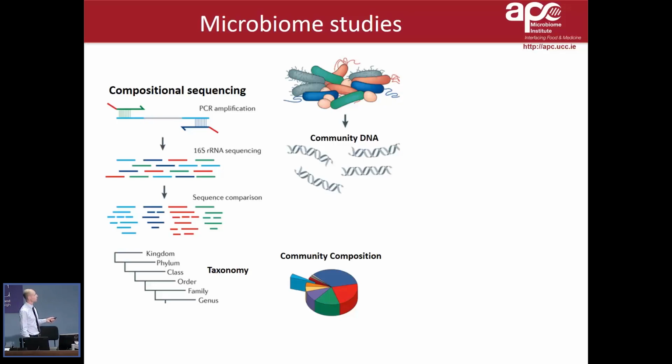So you can take advantage of the conserved regions to carry out a PCR amplification, and then by sequencing the regions between that, you can identify different variations, compare that with databases, and determine just what exactly is present and how that corresponds with microbes that are already in the database, to ultimately identify the microbes which are present in your community. And you get an output that's a percentage. So 10% of the total microbial community present is a lactobacillus, or 5% is a bifidobacterium.